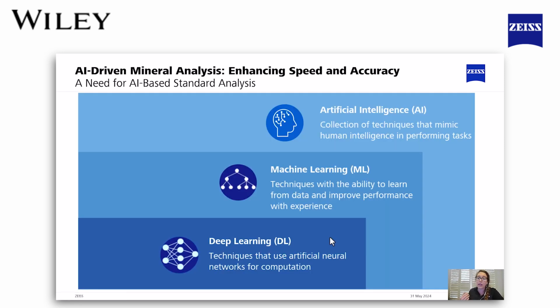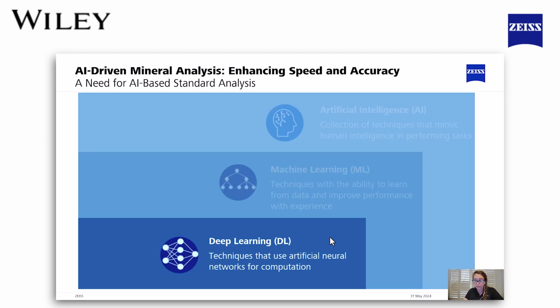This is where AI techniques can really benefit in the analysis strategy. AI techniques can learn about these unique features that experts can identify, and it can provide an automated system for proper identification of mineral grains and particles.